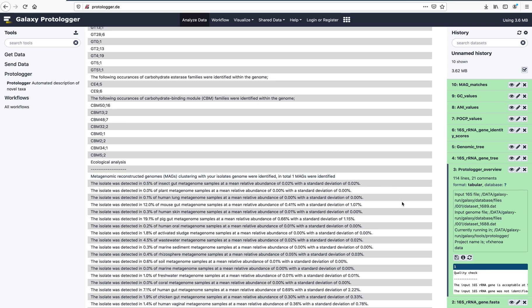The second step of the ecological analysis compares the input 16S rRNA gene to 1,000 amplicon samples from 19 environments. The prevalence and mean relative abundance of the isolate is provided on a separate line for each of the 19 environments.